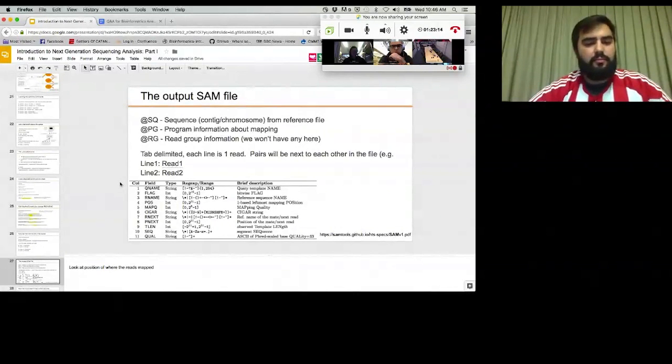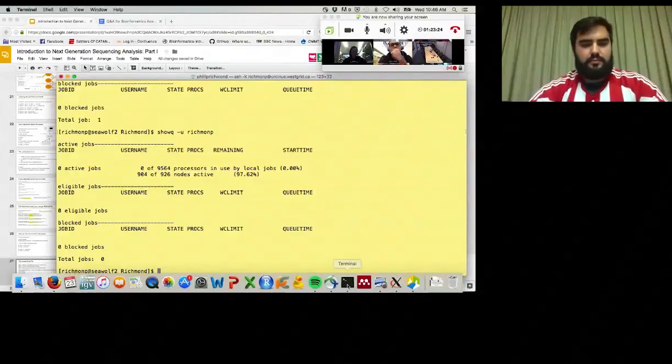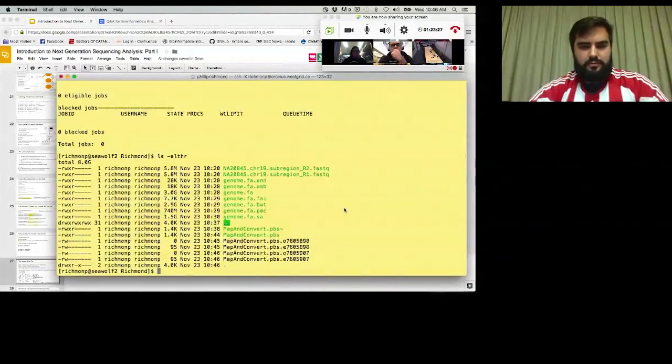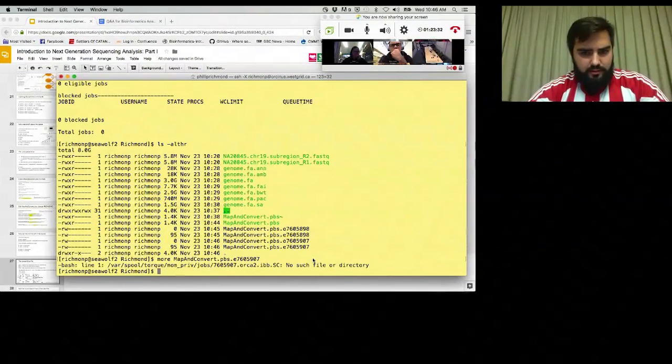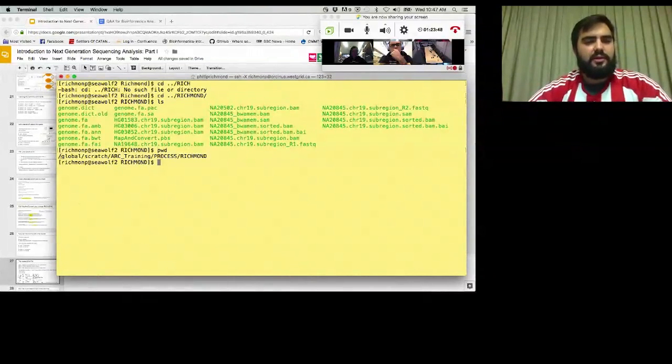So while we wait, I can talk a little bit about the output SAM file. Looks like I'm having some kind of an error. We will address that in just a bit. If you look at my directory here in global scratch, arc training, process, Richmond, you can look at the example SAM file that I've already created.